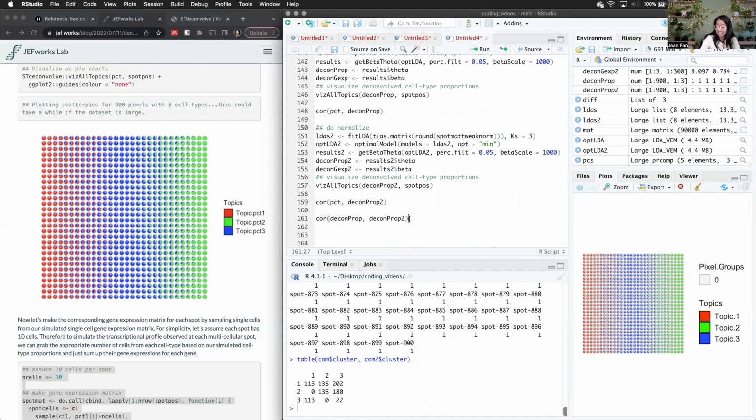Great. So we show that, consistent with the underlying mathematical theory, when it comes to spatial transcriptomics data analysis, for performing dimensionality reduction and clustering, it's really important to do library size normalization, or else the variation in library size could impact our downstream clustering results. However, when it comes to deconvolution analysis with tools like STdeconvolve, whether we normalize or not doesn't necessarily make much of a difference.